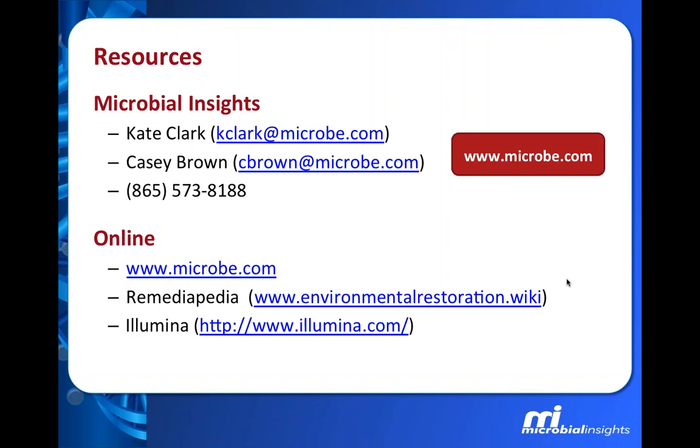Okay, and there's a question about the metagenomic approaches. When do we think that's going to be available? And I kind of alluded to this a little bit in the presentation. There are more and more sequences that are being identified, and as we start to understand these genes and their functions, that's going to make that tool much more valuable.